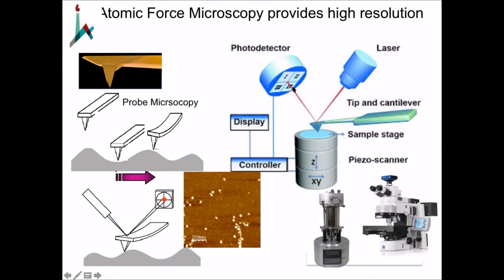The position-sensitive detector is a very sensitive device because it looks at the distribution of light on the 4 quadrants of the detector, actually 2 of the quadrants, and then it ratios them when everything is stable.